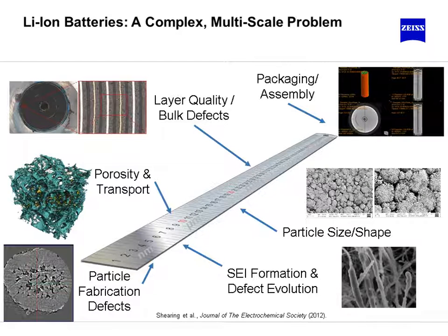But as you slide down the scale, of course, you require different techniques. And in the way you have different assemblies of particles, you can study particle shape and sizes, as well as layer quality and bulk defects before you get to the particle size. But eventually you also want to perform probably porosity or transport measurements, and then even finer individual particle defects, but also make sense of how that is representative or not representative of the assembly as a whole.